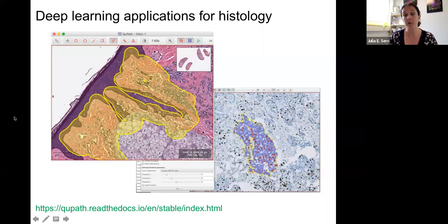And now what we want to do is maybe compare how many cells are in this bit of tissue, how many cells are in this bit of tissue, which ones are labeled with a certain label, what's the area, say it's a tumor section, what's the area of the tumor. Is that tumor infiltrated by immune cells, for example? So it's a really powerful way of doing that.